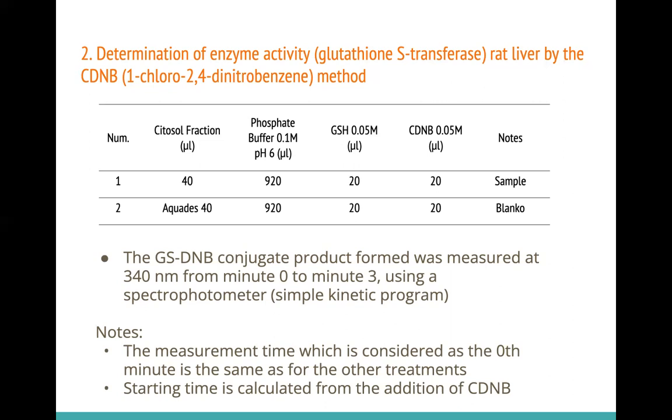So it means after you mix all the reagents there, you need to measure at 0 minute and minute 3. So you have two different measurement results for each sample. So you will have four different measurements there, two for sample and two for blank.